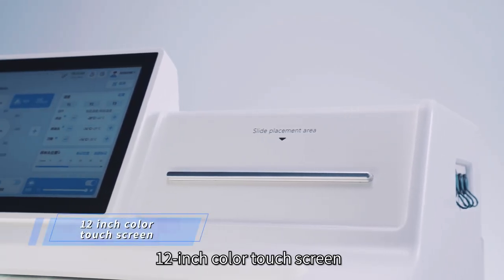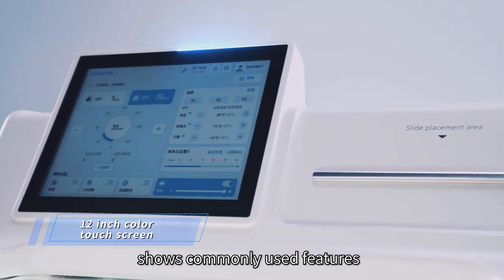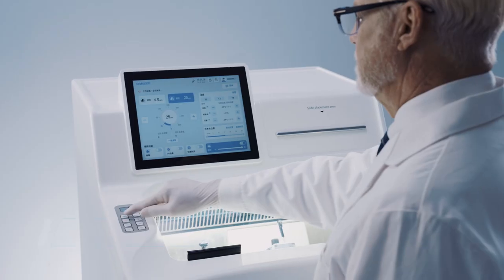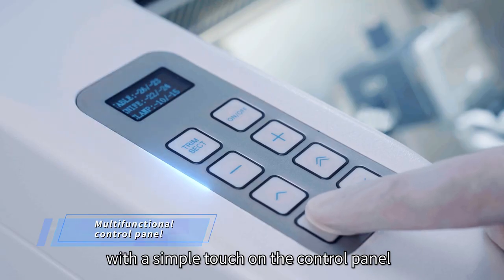A 12-inch color touch screen with a concise UI interface shows commonly used features and parameters directly, easy to learn and use. Configure essential parameters with a simple touch on the control panel.